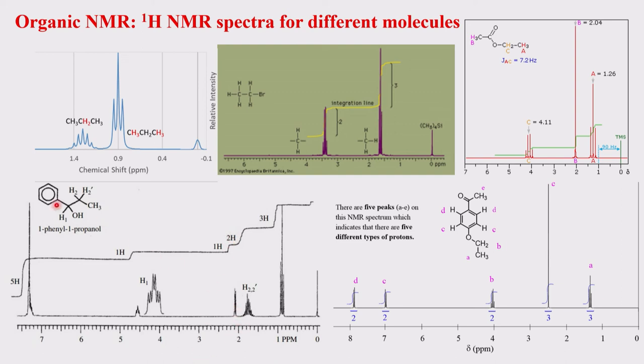Then this OH hydrogen does not couple because it's far away, and therefore that comes here with a little attachment, so a triplet you will get. And now this hydrogen will couple with this one and this one, all of these, so you get a multiplet of that. Now, this CHOH is at the 4.1 level and all these aromatic protons are coming here, so around 7.2, 7.3 range. If you expand, you will see, but here it is not expanded, you don't need to worry about it.